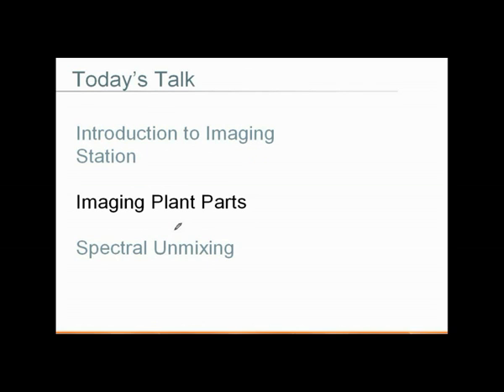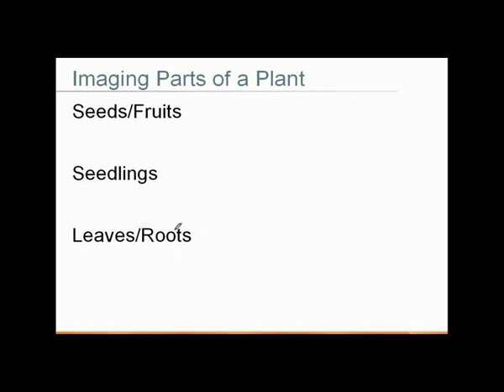So let's move on to some examples of imaging plants and plant parts. I've broken this section into 3 parts: seeds and fruit, seedlings, and leaves and roots. Let's start with seeds and fruits.